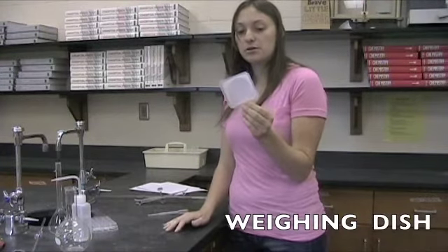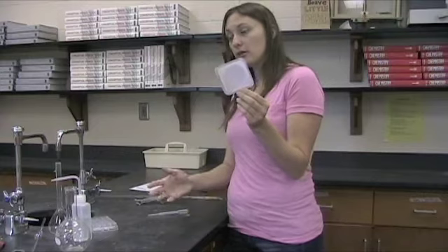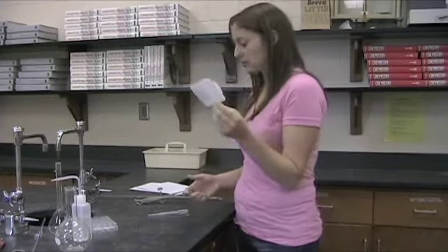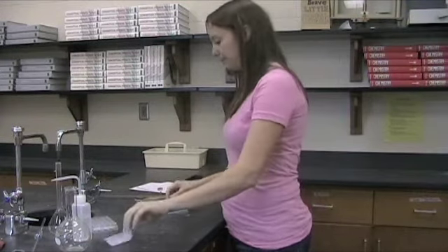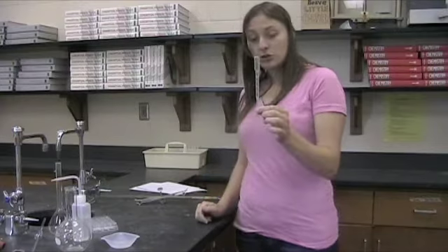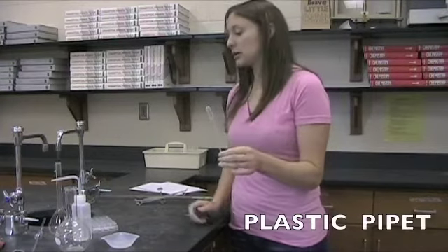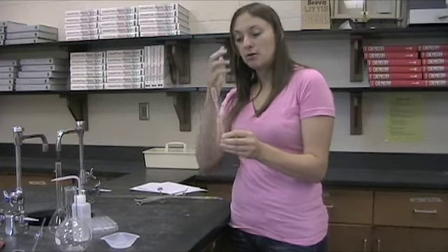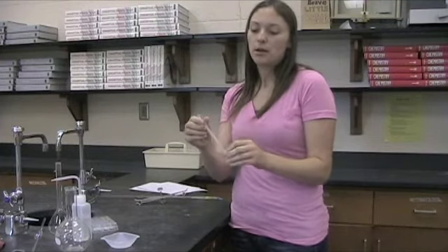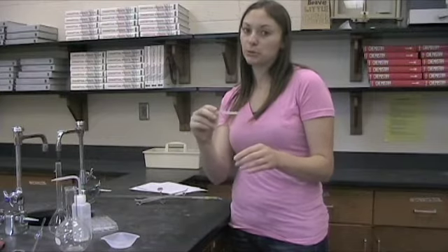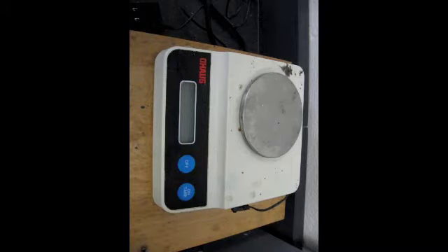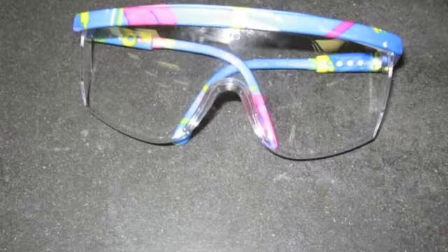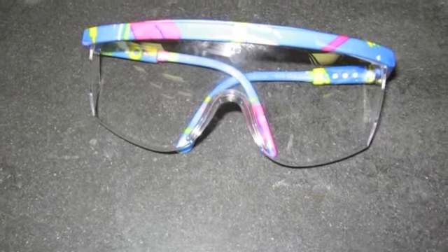Weighing dishes. You will put your substance, your solid in here. And then weigh it on the balance. These are used just to hold them. They are disposable. So you use it once, pitch it. Same thing with these. These are just called regular pipettes. They are like the volumetric pipettes but a lot cheaper. Some of them have little graduation marks on them. They are disposable. Use it once, throw it away. You will also be using an electronic balance which will measure the mass of substances. And of course you need goggles to protect your pretty little eyes.